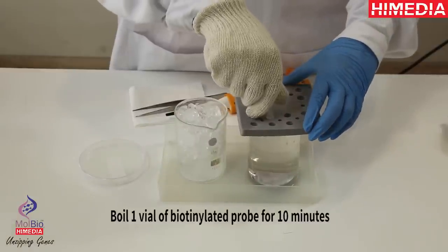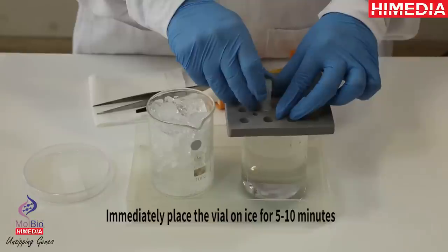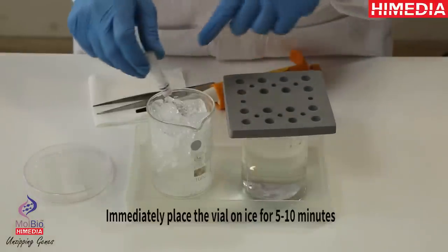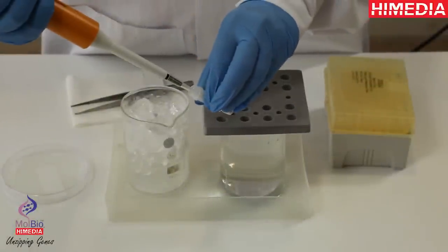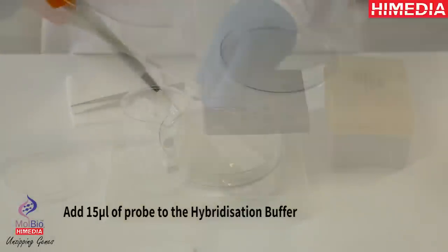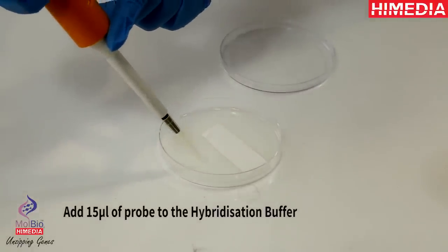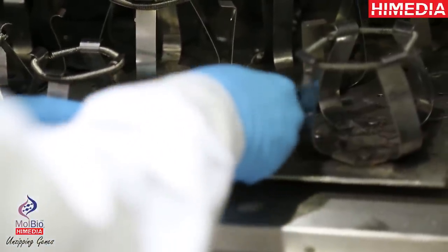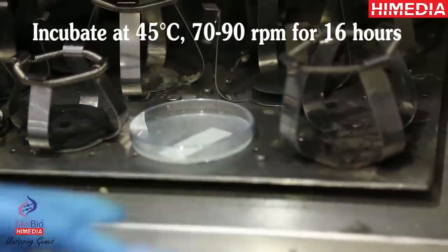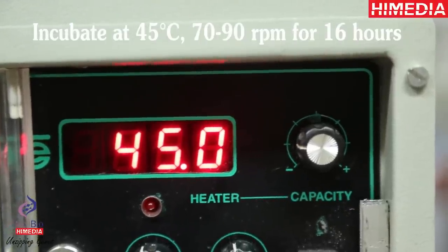Boil 1 vial of biotinylated probe for 10 minutes. Immediately place the vial on ice for 5 to 10 minutes. Add 15 microliters of probe to the hybridization buffer. Incubate at 45 degrees Celsius, 70 to 90 RPM for 16 hours.